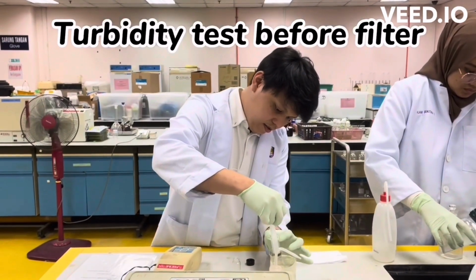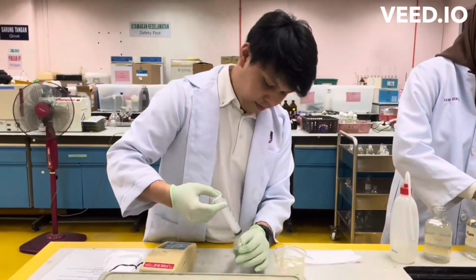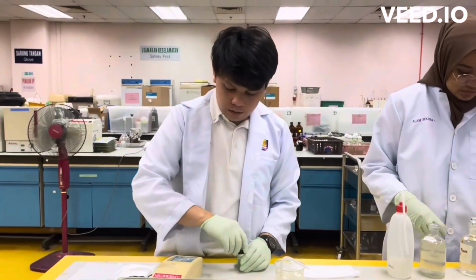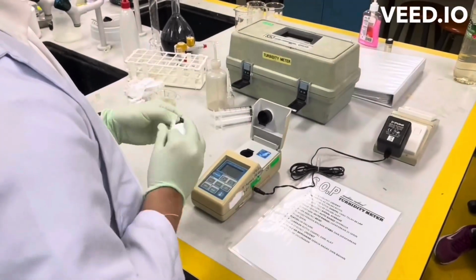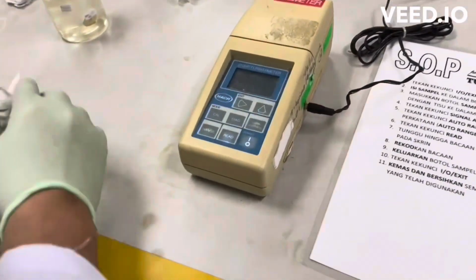This is the turbidity test before filter. First, we're going to fill 15 milliliter of water sample into the sample cell, and then we are going to clean the sample cell to make sure that there are no fingerprint stains. And then by making sure the signal average and auto range in display, we are going to press read to get the measurement.